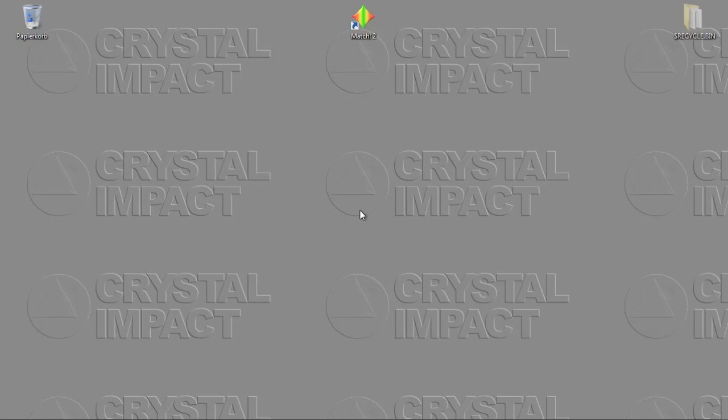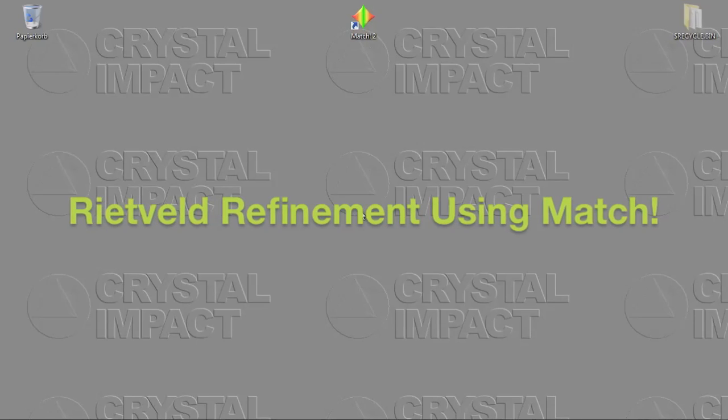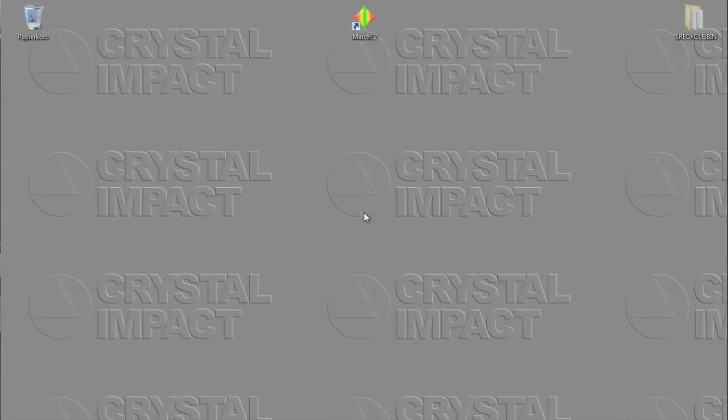Hello everybody, my name is Holger Putz and today I would like to show you how you can run Rietveld refinement calculations with our software package MATCH.